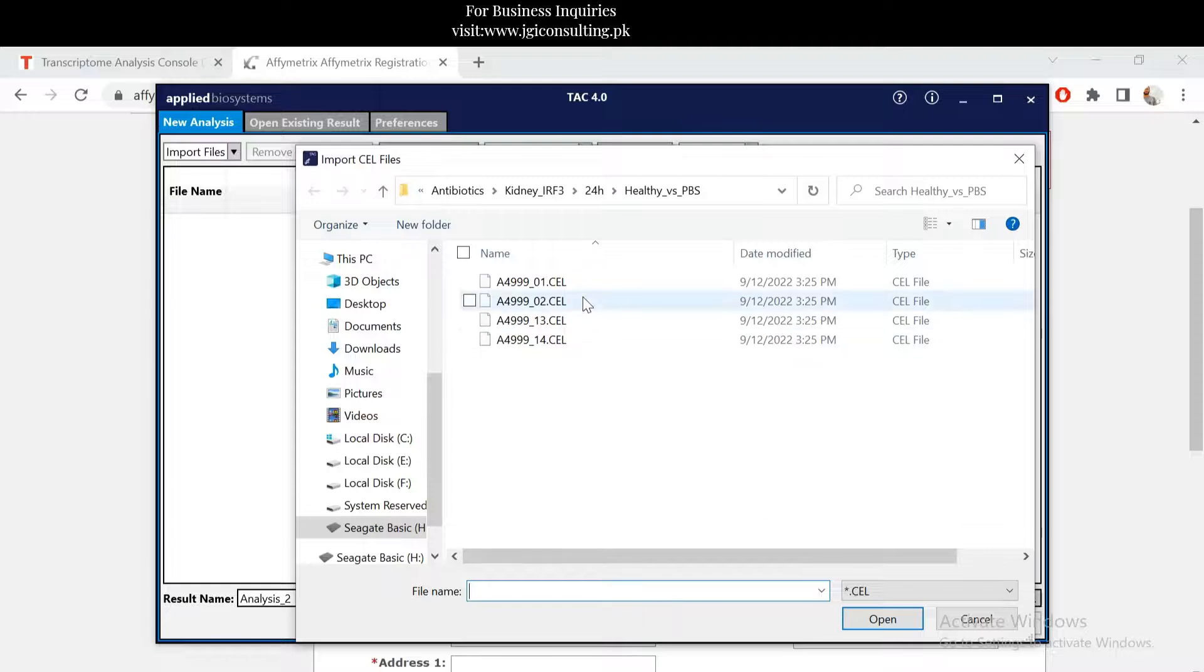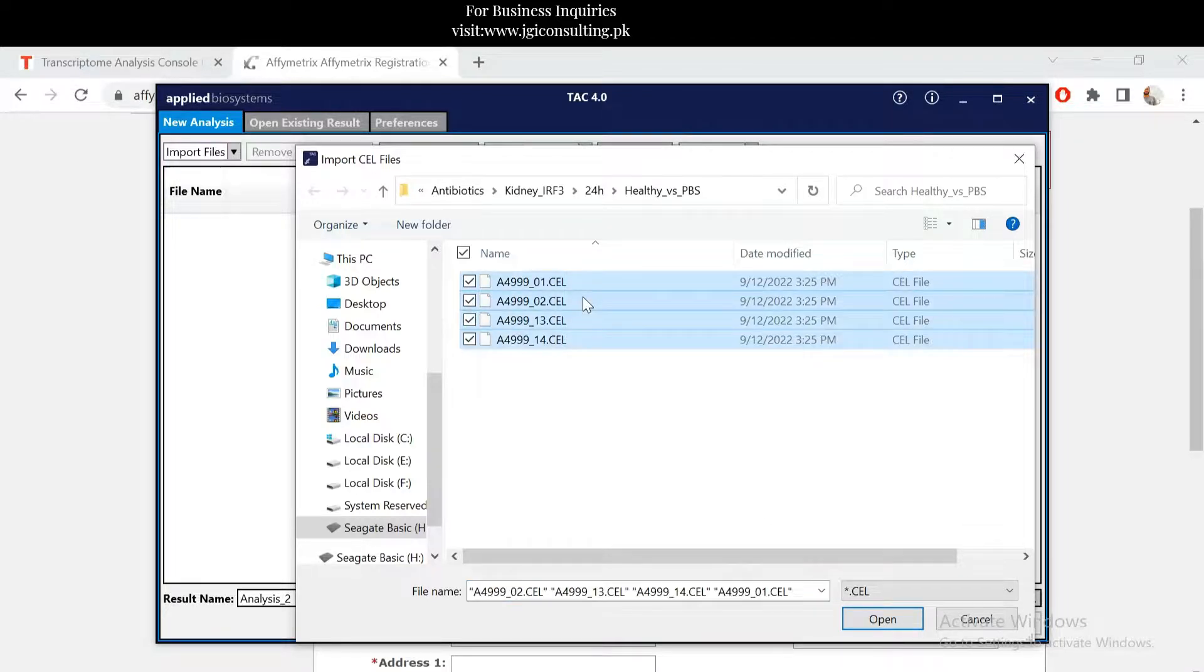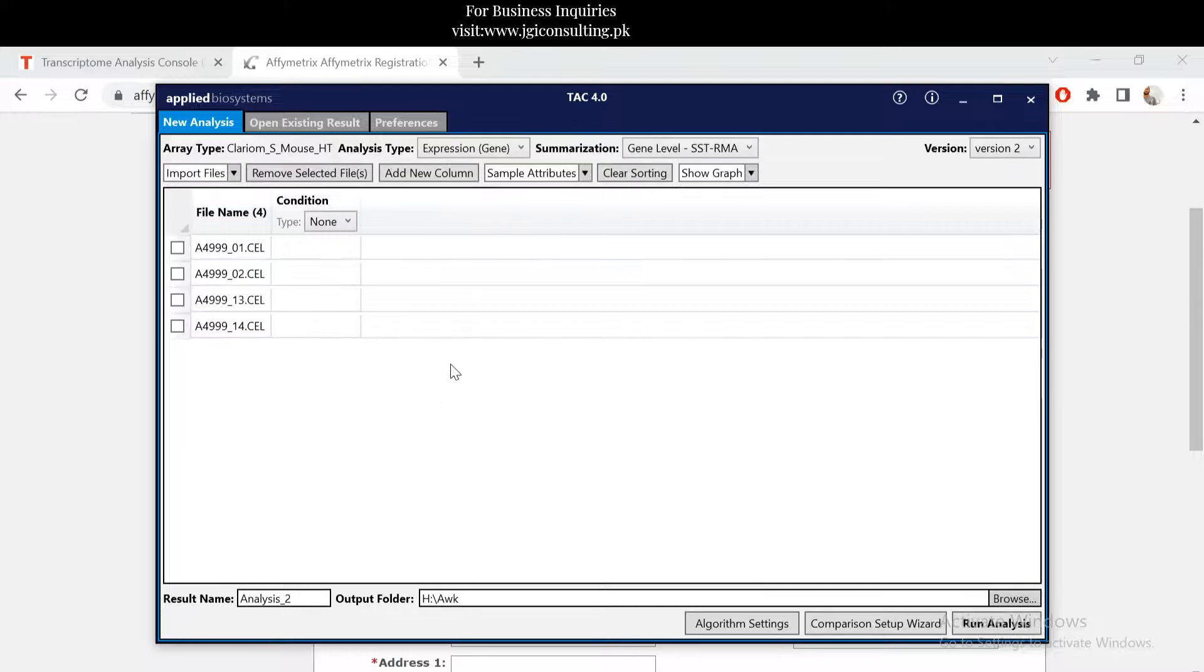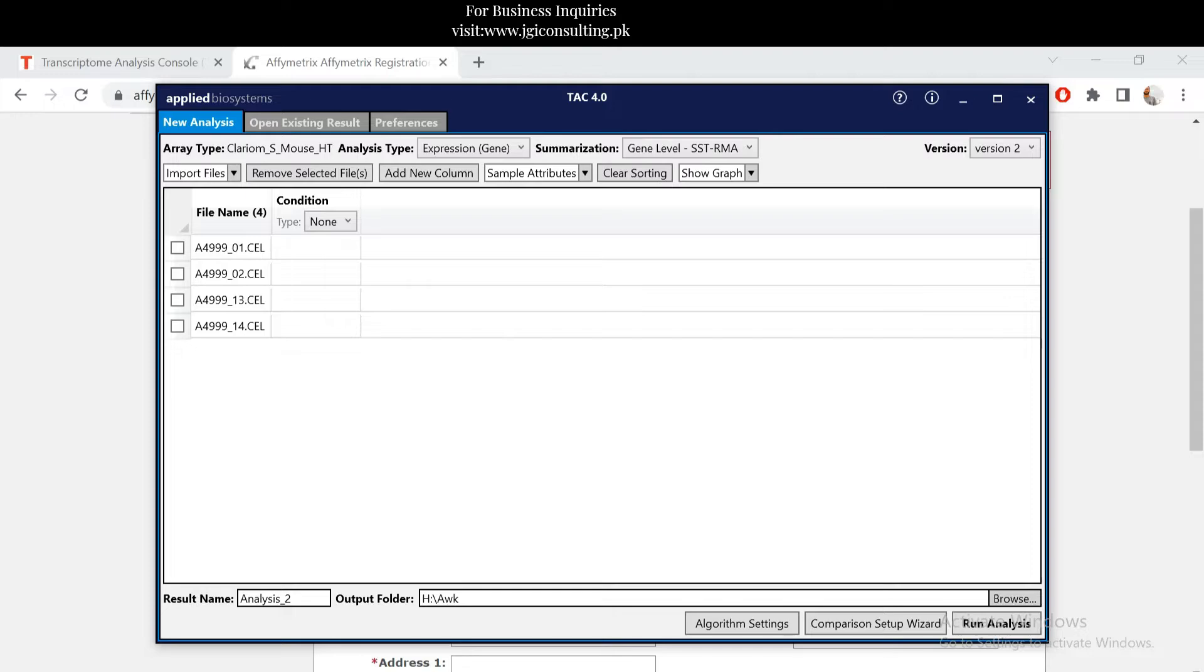You can just import the files and then you can run your own analysis. For example, if I set all the files and then you can run the analysis, I will explain that in the next tutorial. Thank you.